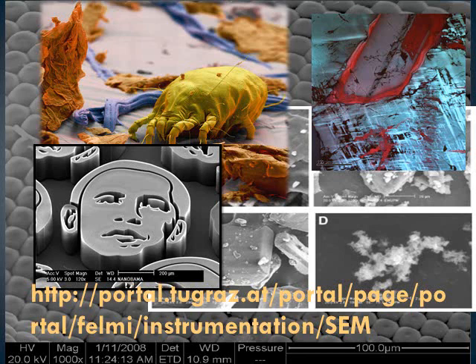Although SEMs are large, expensive pieces of equipment, they remain popular among researchers due to their wide range of applications and capabilities, including the high resolution, three-dimensional, detailed image they produce.